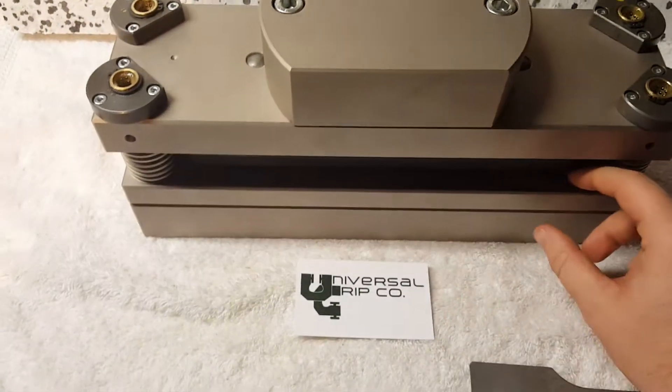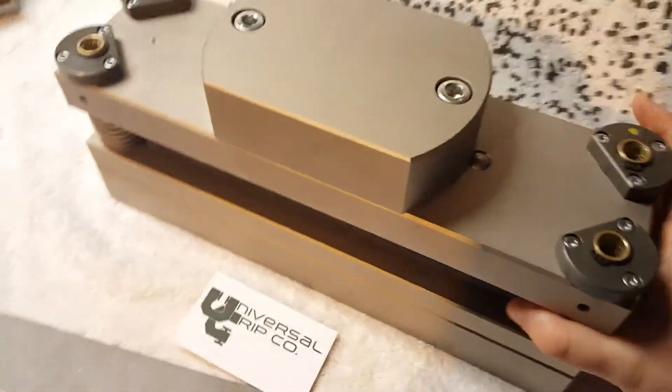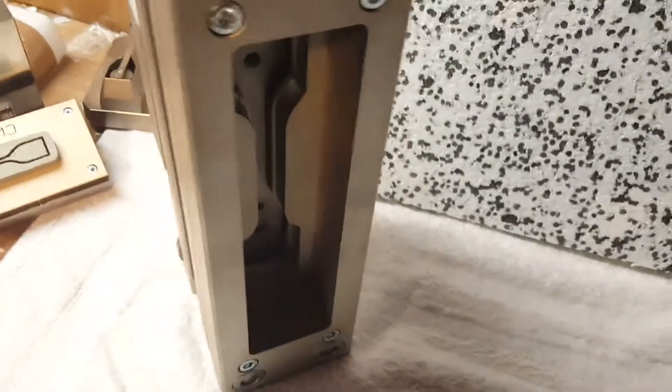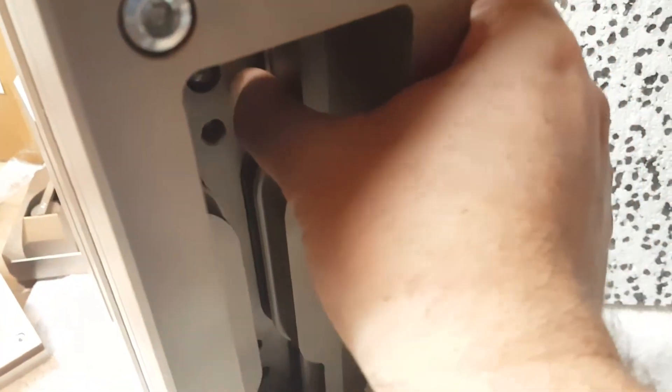If I flip this over, you can see the bottom cutting edge here. It's a pretty serious piece of steel — the whole thing is about 40 pounds or so. You can see the cutting edge here, and that's the part that actually comes down and stamps out the sample.